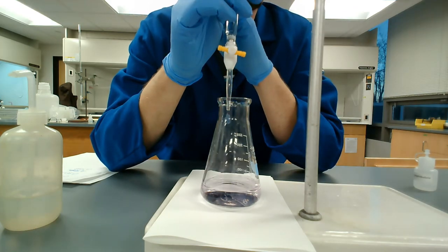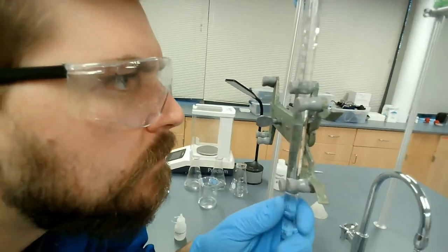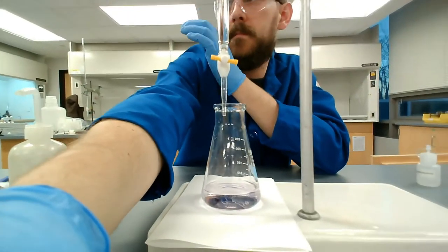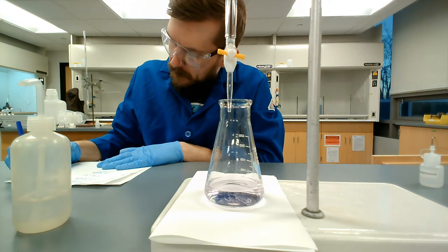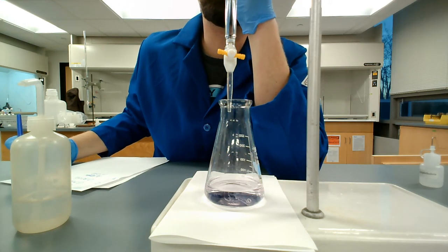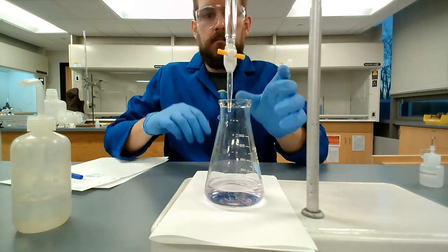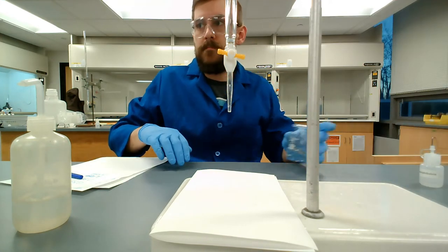So I'm rotating the burette back around so I can read the burette reading. I'm bringing the camera up to show my eye should basically be at the meniscus level, and I should only be 5-6 inches away from the burette, right? You don't want to read the thing from 2 feet away. You won't be able to see the lines appropriately, and the closer and more level you get, the less issues we have with parallax, where you're looking at the bubble not straight on, but from above or below. Right. So that's the first one.